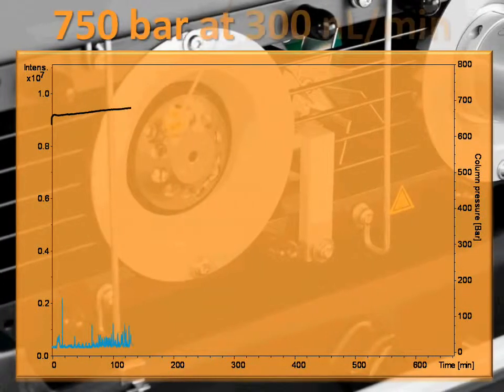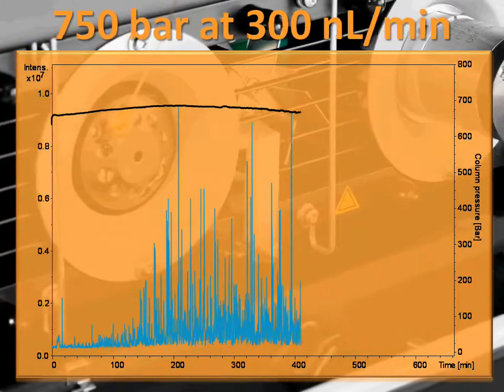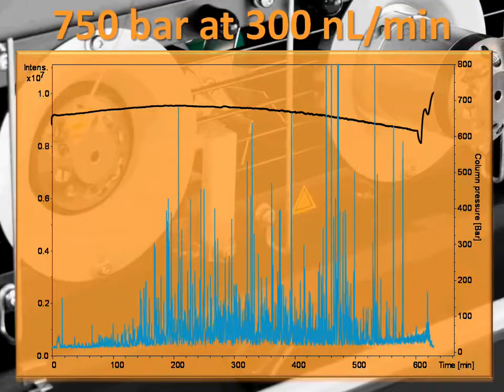Here we can see incredible resolution with a peak capacity of over 700 achieved by running at close to 750 bars at a flow rate of 300 nanoliters per minute.